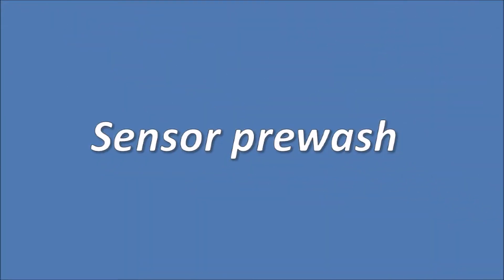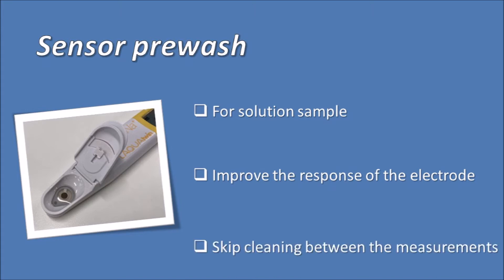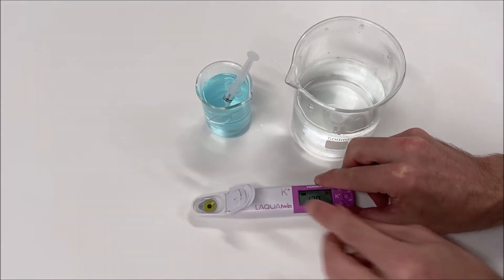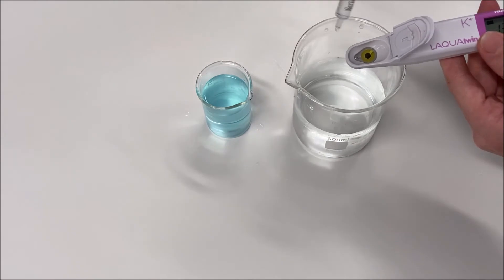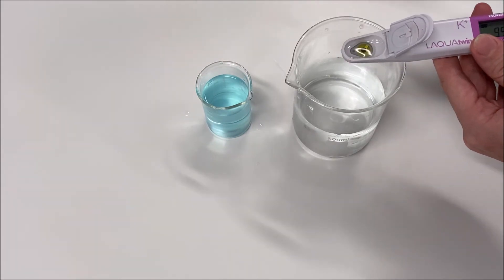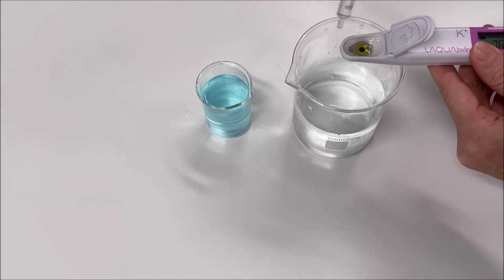When testing solutions, you can do a sensor pre-wash with the sample — it will improve the response of the electrode. Doing a pre-wash also allows you to skip the sensor cleaning between each measurement. To do the sensor pre-wash, remove the previous sample and wash the sensor with the new sample to measure for three to five seconds, then empty the sensor. This procedure removes the residual micro drops from previous samples and prepares the sensor for the new sample analysis.